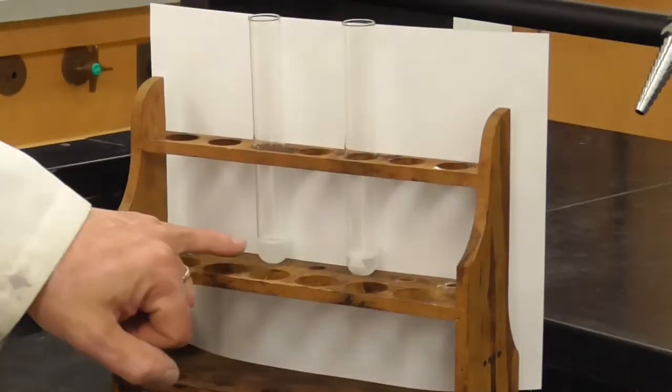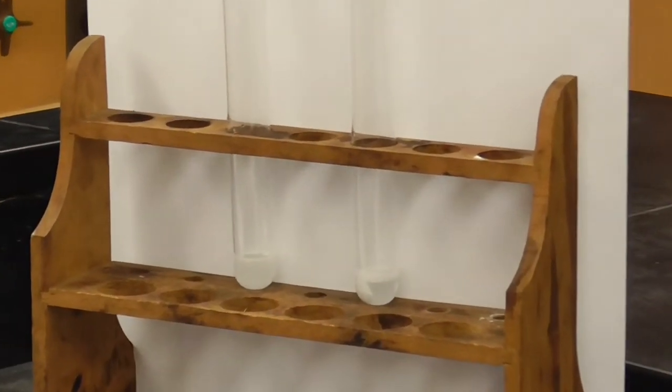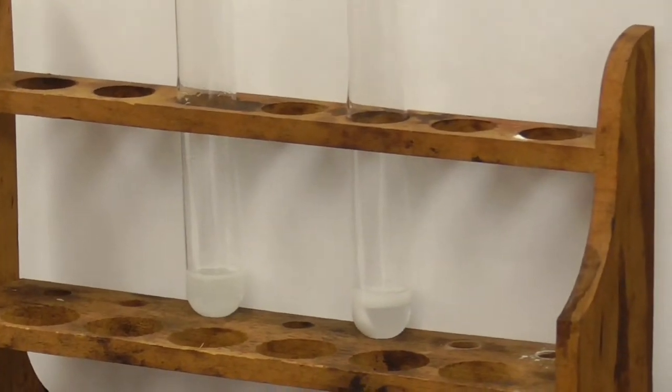This one's almost all the way out, just a little bit of gas now. This one's still going along. So again, the difference in kinetics, which one went fast, which one went slow.